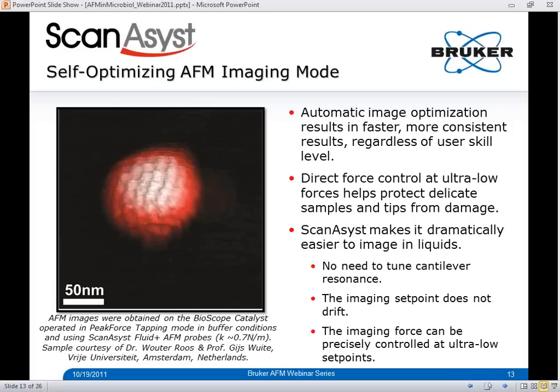It is important to note that these virus particles were imaged as individually isolated particles. As virus capsids are very delicate, high-resolution images have typically been obtained using jumping mode AFM, which is similar to Peak Force Tapping in that discrete force curves are conducted along the fast scan axis. However, Peak Force Tapping can employ much lower imaging forces, which is very important for these sensitive samples. In other AFM studies of virus capsid structures where tapping mode was employed, particles were typically arranged in a two-dimensional crystal structure, which provides mechanical stability so they are not distorted or damaged under the AFM probe force.